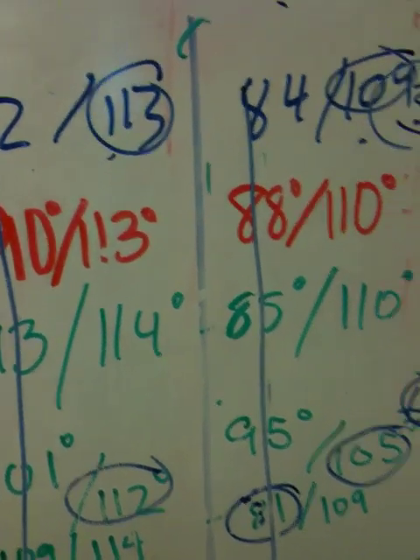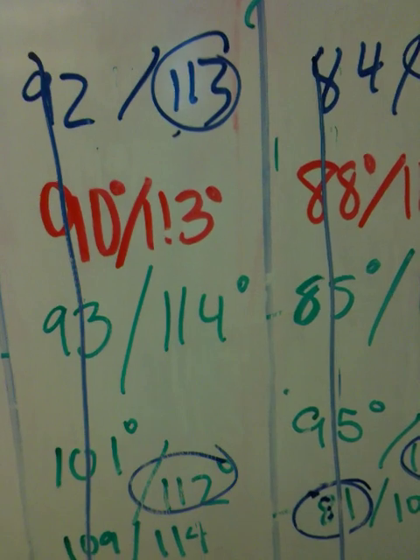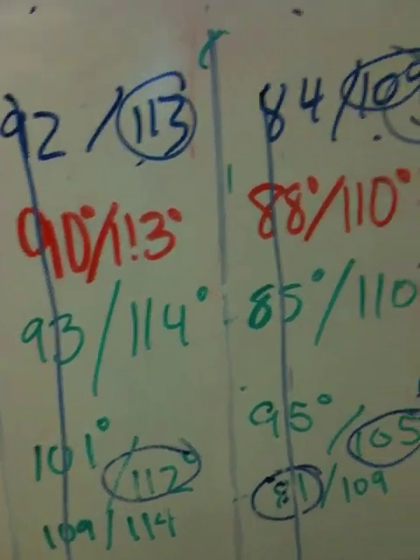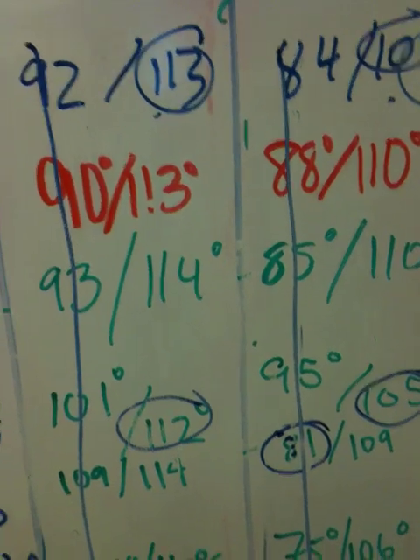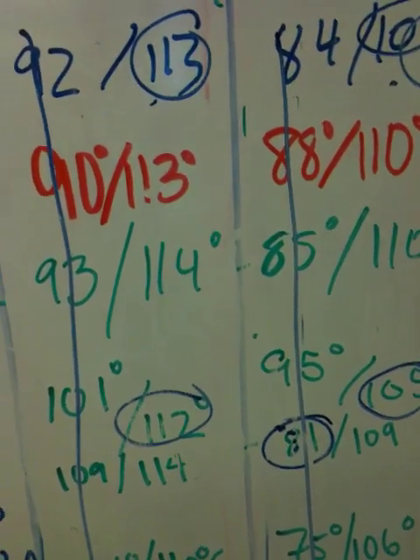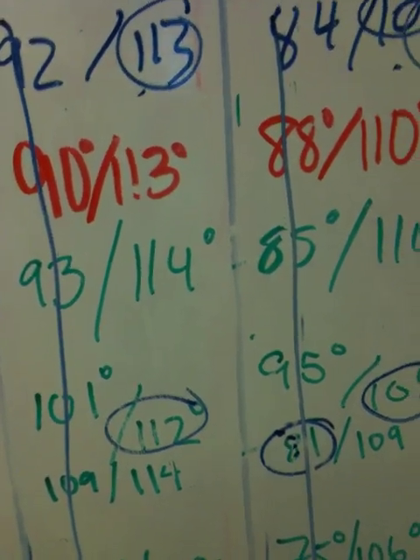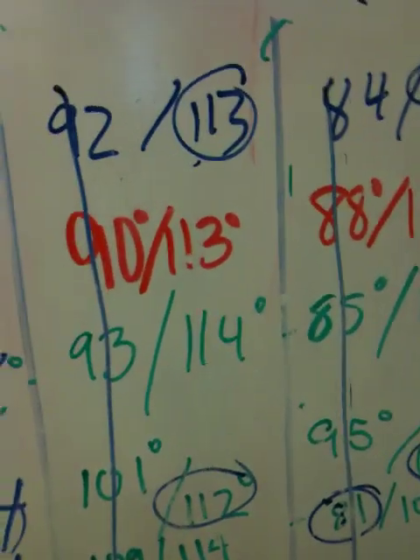There's a gradient in the sample holder, and it gets cooler as you get farther away. So if you have too much sample or dust up in the cool area, you will get a higher end to your melting point. There are calibration issues with the thermometer. The rate at which you heat it has a huge effect on the results. Sometimes people put too little sample in. So we came up with a whole bunch of errors.